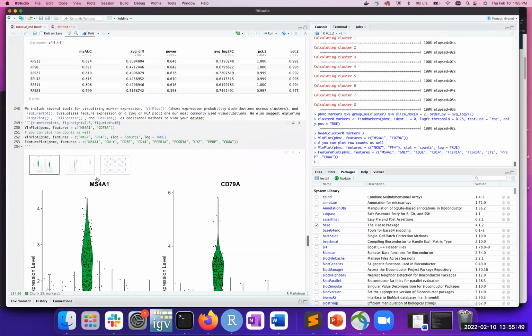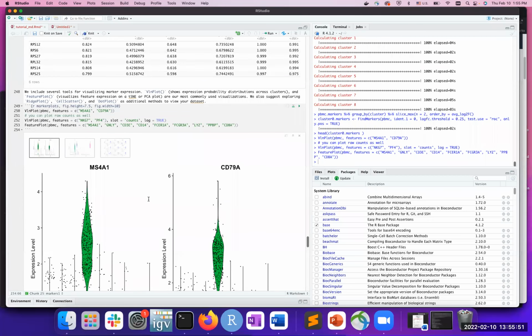Okay. Hopefully you'll run it by now. It should be fairly quick.